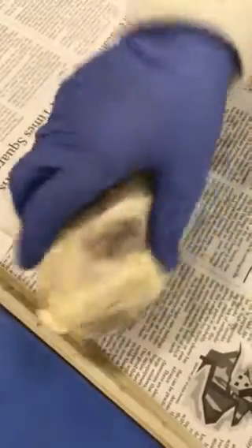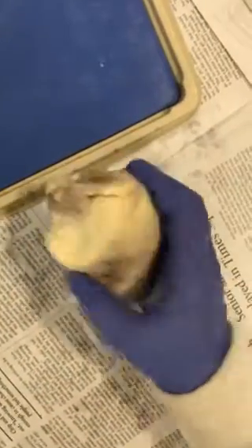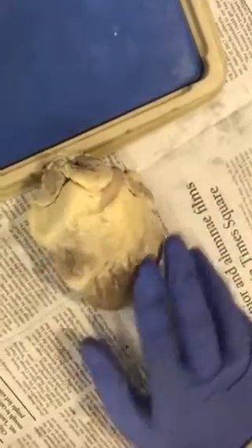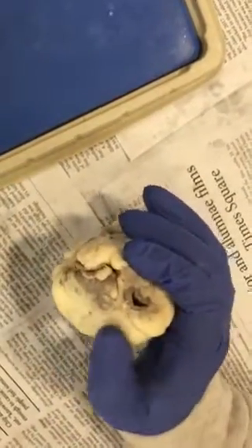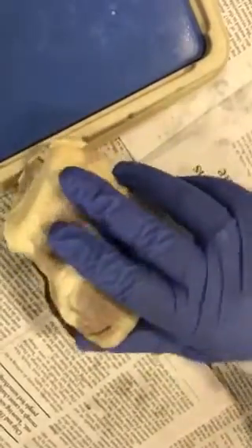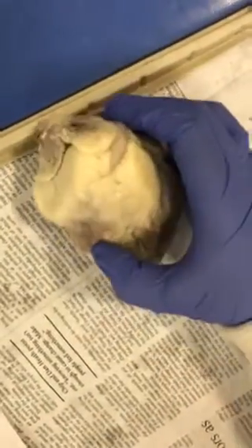at the bottom. And the anterior side is here. You can see that this is the anterior side, which is basically the front side, because you can see the two different ventricles. Here you can see the right ventricle because there's a little divot, so that's where it caved in. And here you have the left ventricle. As for the atrium, the right atrium is around here, and the left atrium would be right around here. You can see that more when we cut into the frontal plane and went inside, but those are roughly where the four chambers of the heart are.